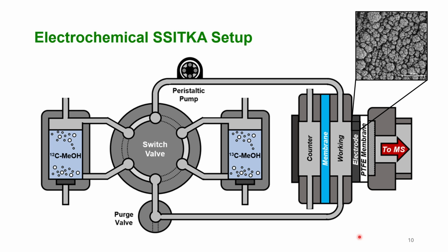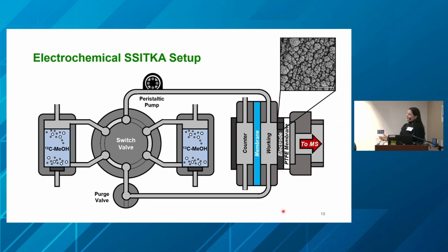And we also included a purge valve in order to eliminate mixing of the electrolytes. And if you're coming onto the lab tour today, you will see the setup in real life, and hopefully you can gain a better appreciation for what went into designing something such as this.